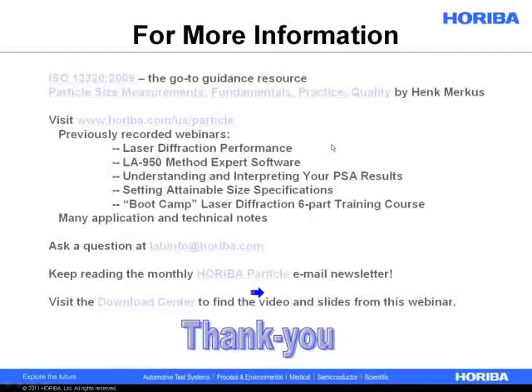I wonder if you're asking how useful is laser diffraction or how reliable is it? It is a bit of a challenge when the particle becomes very similar to the wavelength of light. I can tell you that it was a much bigger technical challenge several generations of analyzers ago. Now the signal-to-noise ratio is so good that you can extract a lot more useful information, even when you run into the physical limits of the technique and the physical problems of the technique. Again, it's a hard question to answer in this format.